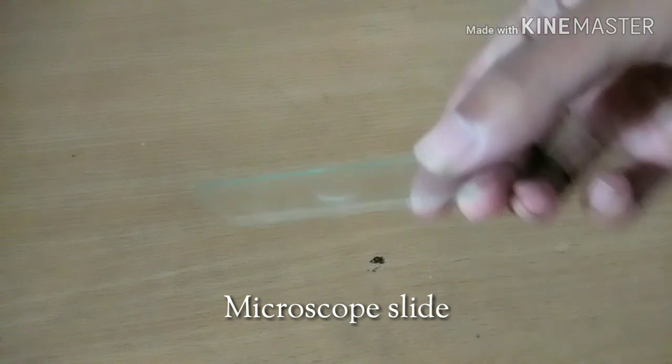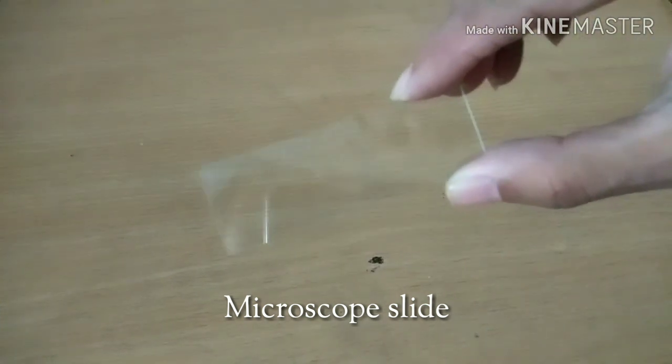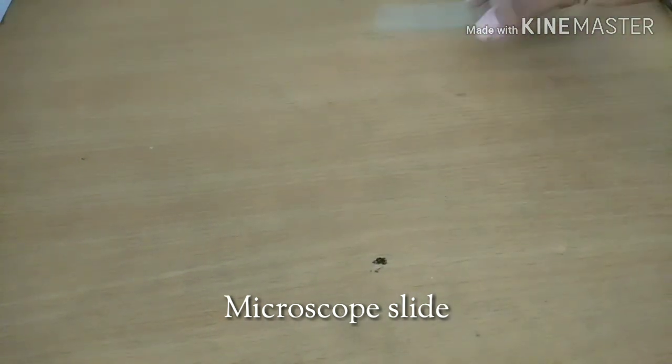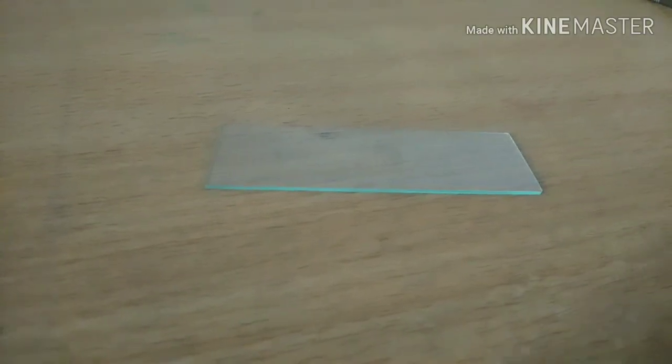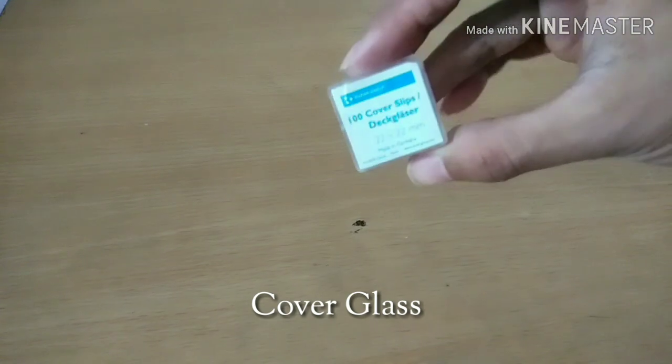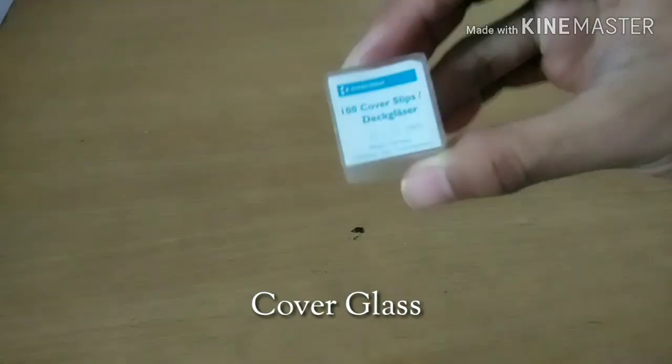Microscope slide, the place to put the sample of object. Cover glass, to cover the object on the microscope slide.